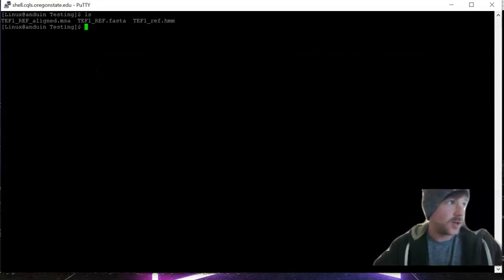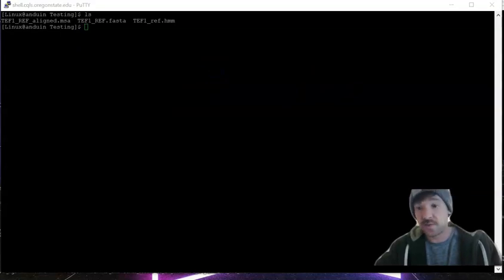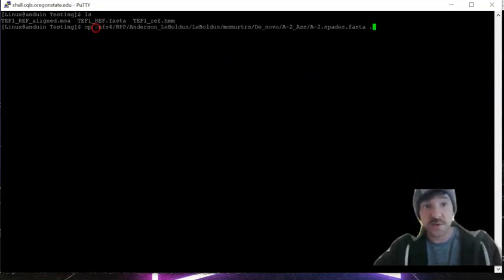After we build a .hmm file, now we're going to copy over a full genome sequence that we want to test.